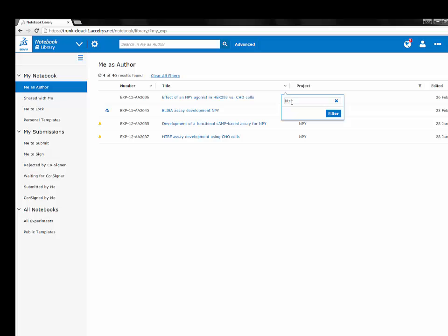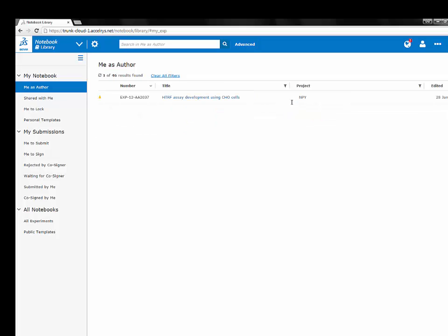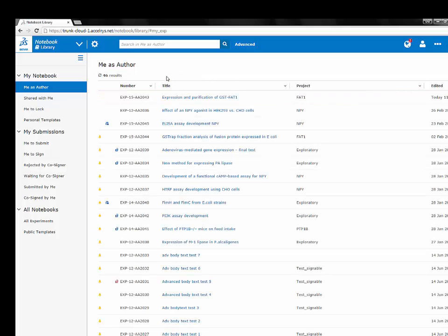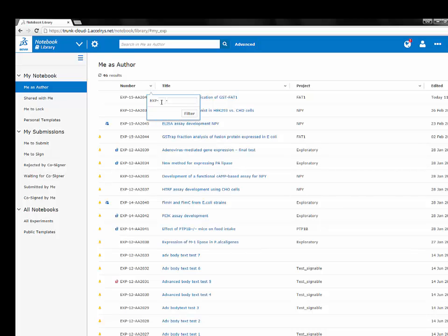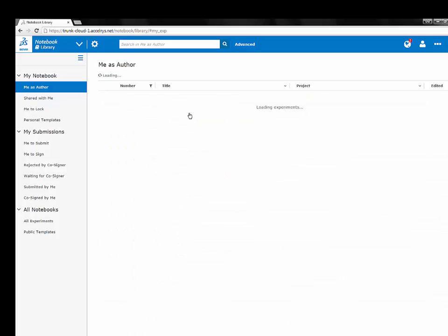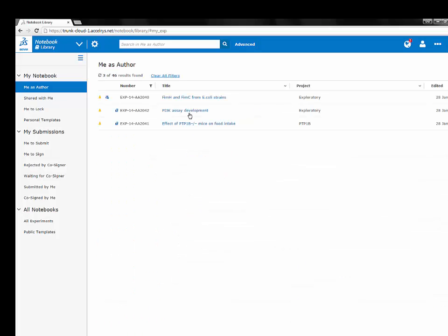By clicking on a column title you can sort the list alphabetically. By clicking on number you have the ability to search by year, the first part of the experiment number, which replaces the previous year folder structure. You'll also notice that more information is made available for each experiment within the library.